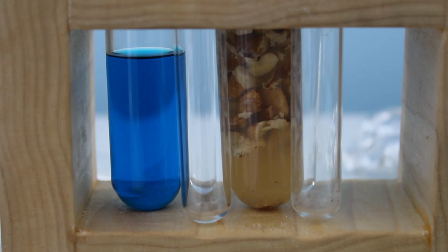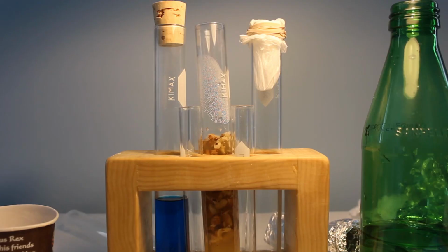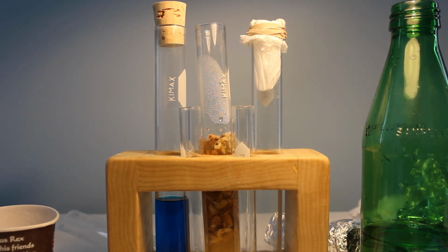Oh my lord. I'm going to filter it out, get the nuts out, and then have the yellow vile liquid. And then we'll test it for sugar. Okay, so now we have our nut juice, and all we have to do is filter it out and get only the vile juice and none of the nut.